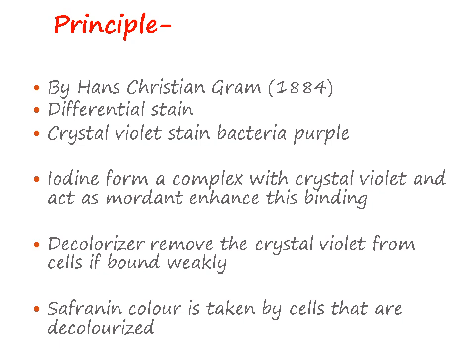when you use a decolorizer. Decolorizer is an organic solvent. It will remove the lipids from the cell wall of the gram negative organism. Also the peptidoglycan layer is very thin in gram negative organisms, so this complex will not bind very strongly, and when we use a decolorizer it washes away this complex in the case of gram negative, but it will not wash away the complex from the gram positive organism cell wall.